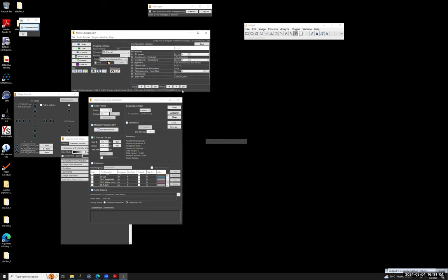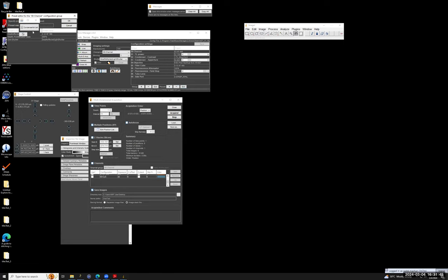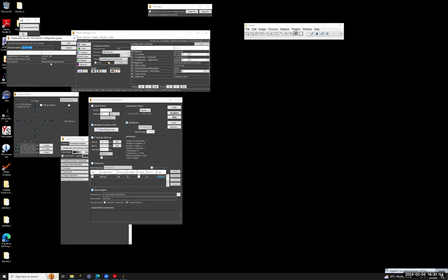And how I dealt with this issue is that in most cases, I'm not saying that it's always the case, but for most cases, users use multiple fluorescence channels and one transmitted light channel, either maybe bright field or phase contrast, but often it's just one transmitted light channel plus maybe two or three fluorescence channels. So how I dealt with this in this setting called FL, I have changed it here so that the settings for the channels do not contain any settings relevant to transmitted light imaging. So then it will rely on whatever I set here. That will then apply to transmitted light settings.